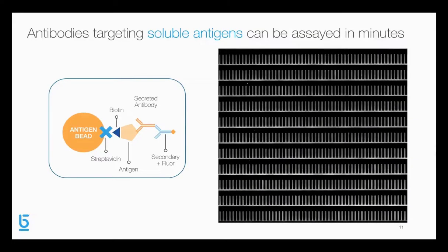This assay is performed on tens of thousands of cells simultaneously. In this field of view, hundreds of cells are screened to identify less than a dozen hits.